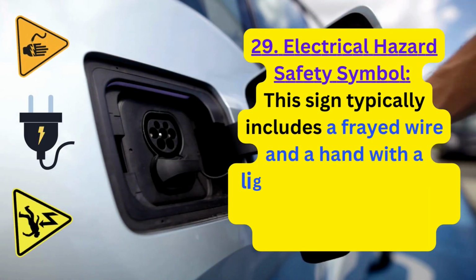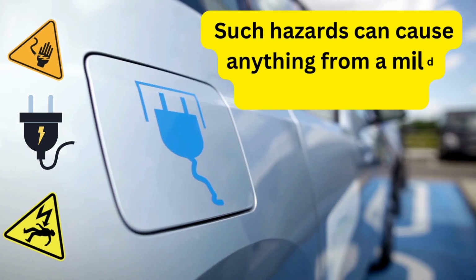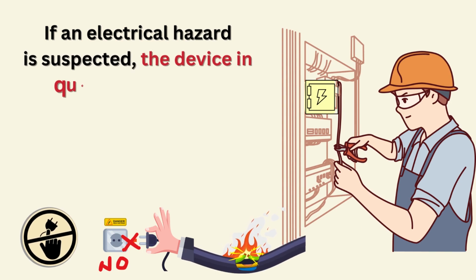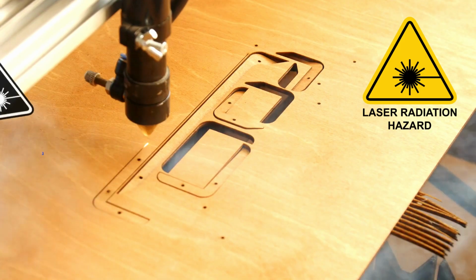29. Electrical hazard safety symbol. This sign typically includes a frayed wire and a hand with a lightning bolt across it, and indicates any electrical hazards in the lab. Such hazards can cause anything from a mild tingling to death. If an electrical hazard is suspected, the device in question should be disconnected immediately and the cause must be determined by a qualified technician.